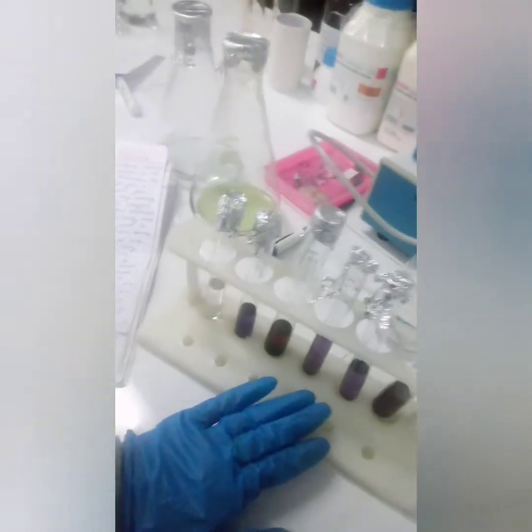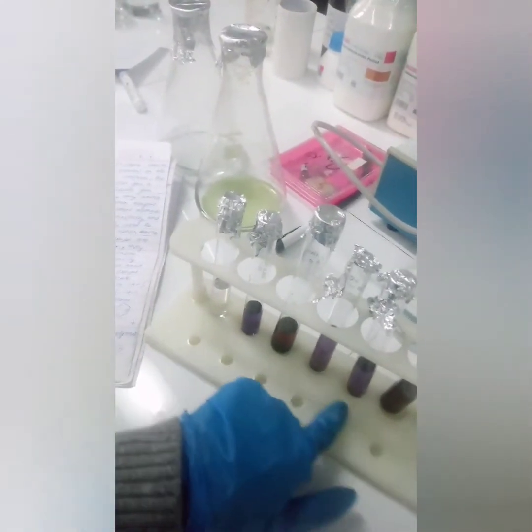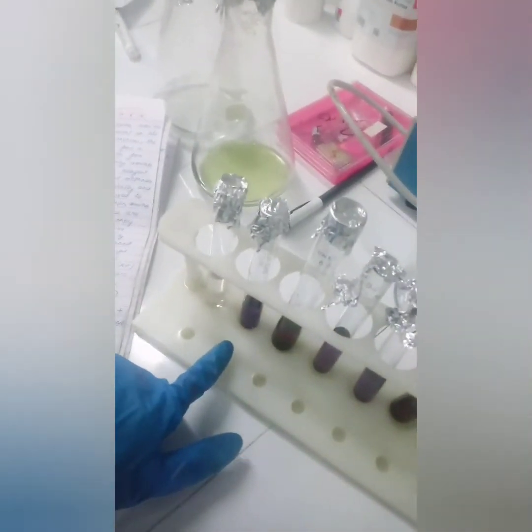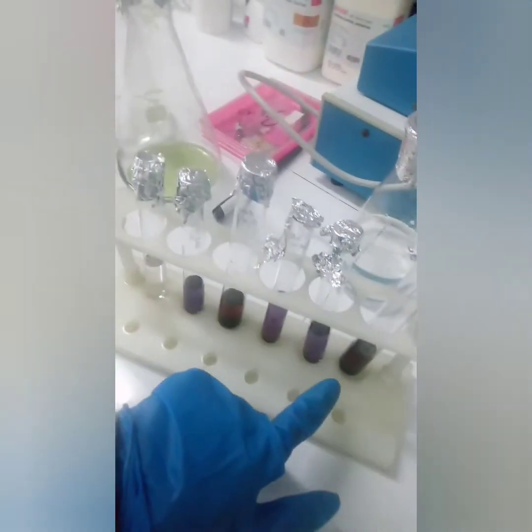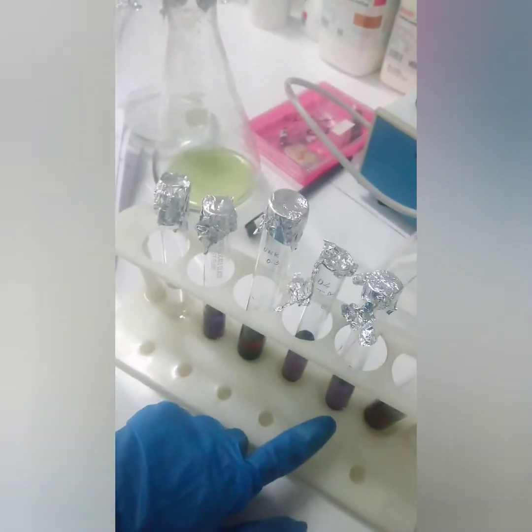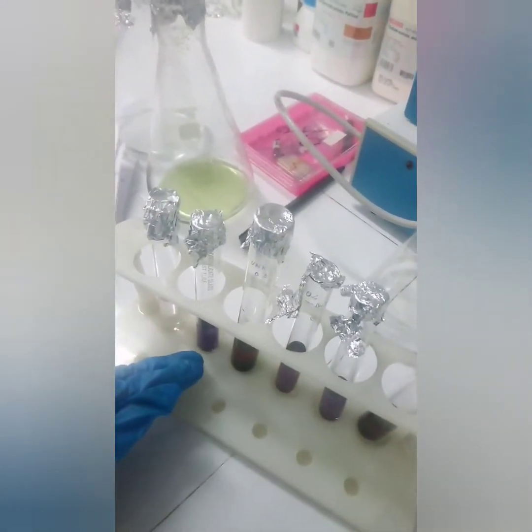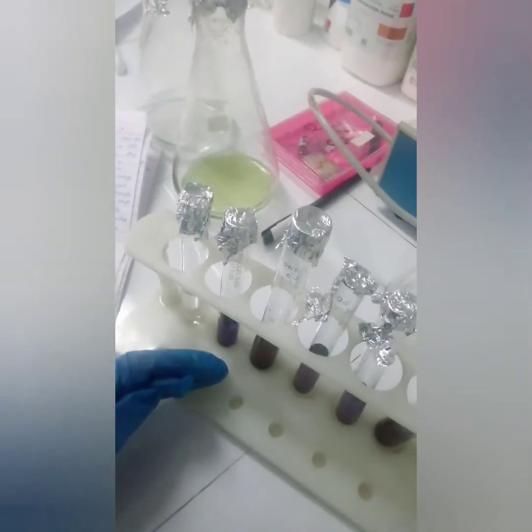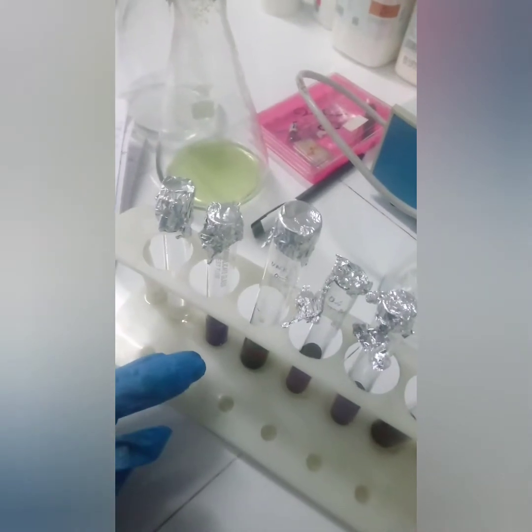Since we are giving different amino acid concentrations, the intensity of the purple color in all the test tubes is different. Some are darker and some lighter, because the darker ones have a high concentration of amino acid.